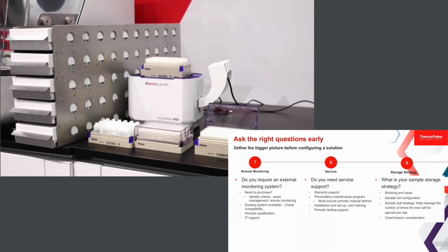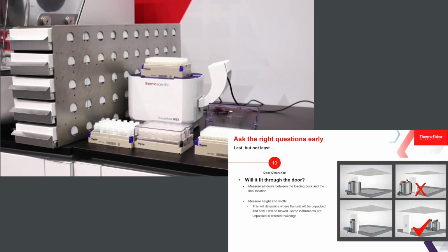I've seen so many freezers, and this is not a dig at anybody specifically, but there's so many different lab people using the same freezer that it tends to get really crowded and really messy with different boxes and different vessels everywhere. Think ahead before you start buying your new solution. Is there a way that you can consolidate that, to organize it, to help the performance long term, but also make it easier for your lab team, right, to find their samples?